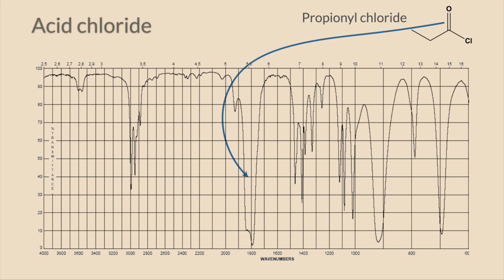One of the interesting things here is that we have this carbon-chlorine stretching frequency, slightly lower, but quite prominent, and you can easily identify that. In fact, because chlorine is a slightly larger atom, if you remember the Hooke's law that I explained, this will lead to absorption at lower frequency.